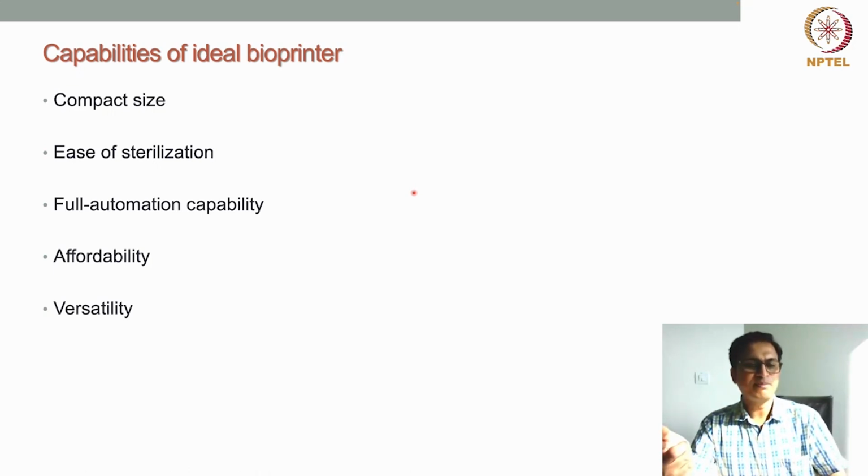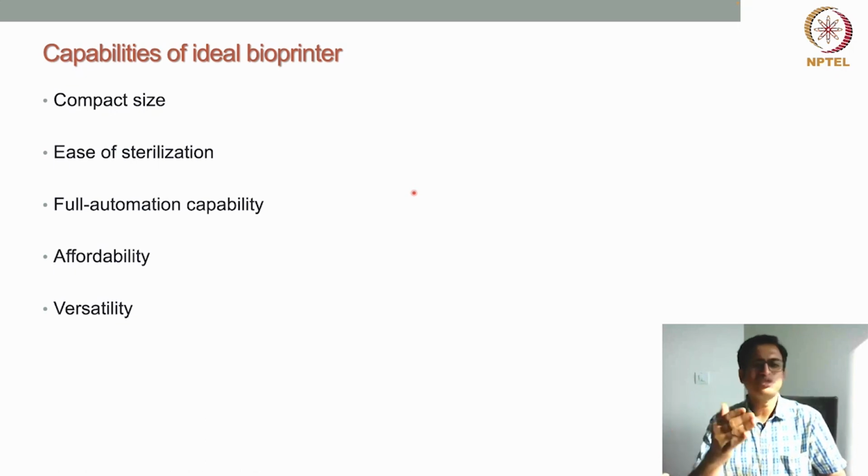Full automation capability. The whole process should be automatable, right? There should be very little user intervention required. Some of the printers allow this, but mostly they are semi-automatic, not fully automatic. But the bioprinting process should be fully automatic, and the full automation capability should be there.